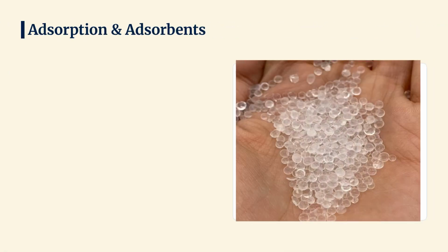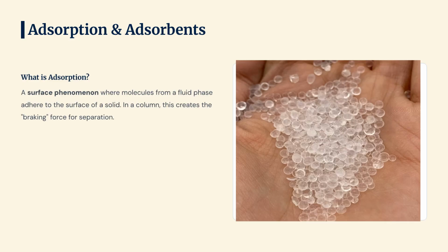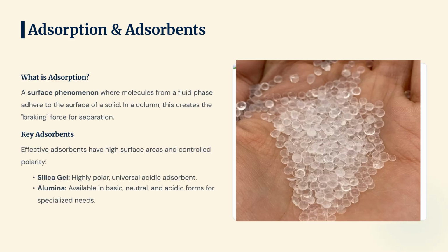Let us first get acquainted with the word adsorption. Adsorption is a surface phenomenon where molecules from a fluid adhere to a solid surface. Common adsorbents include silica gel and alumina, which have high surface area and controlled polarity.